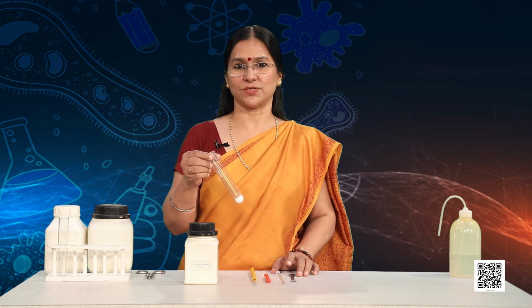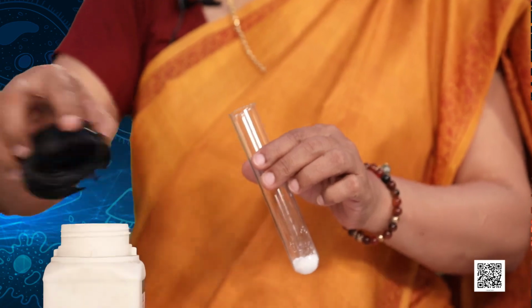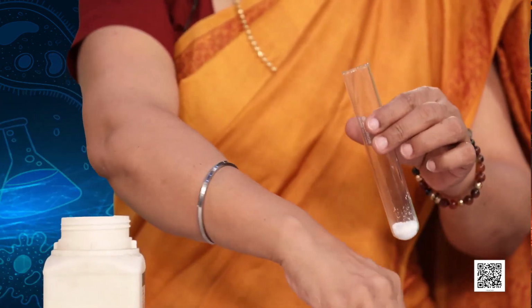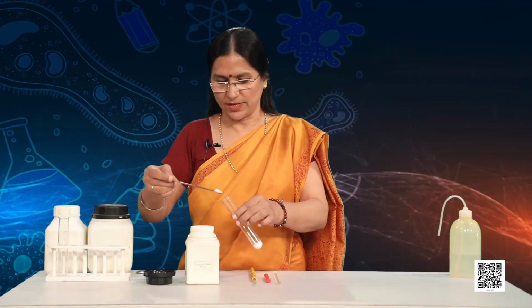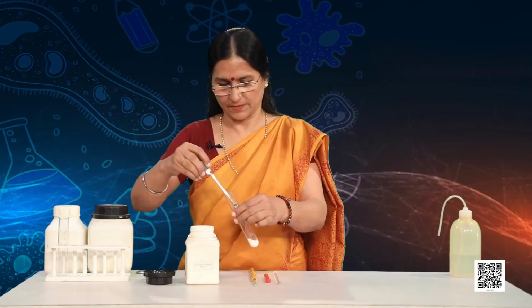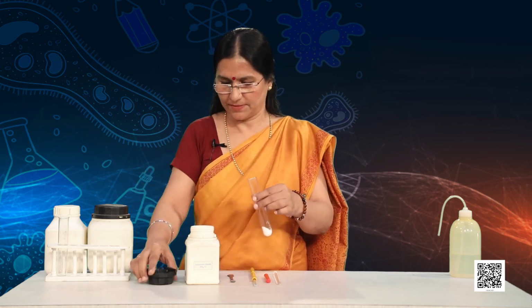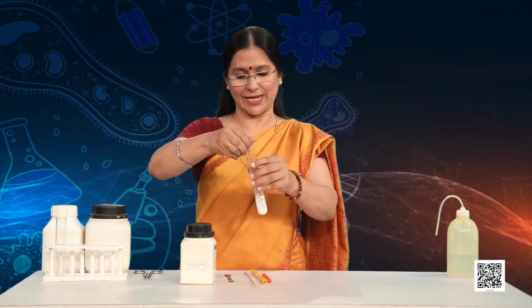Now observe carefully. I will show you an activity and you will tell me whether it is an exothermic or an endothermic reaction. Here I have taken around 2 gram barium hydroxide in this boiling tube. Now I am going to add ammonium chloride. Approximately, these both have to be taken in a 2:1 ratio. So here I am adding approximately 1 gram of ammonium chloride. And after adding it, now I am going to mix it with the glass rod like this.